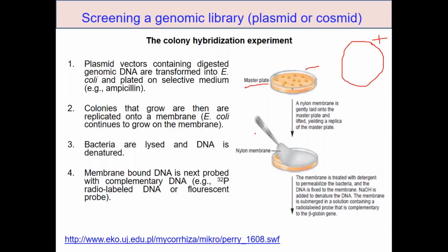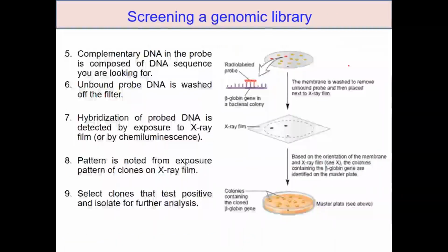One or two cells from each colony will be stuck. The position will be the same. Understood or not? You guys are following what I'm saying? Yes, exactly. Impression of colony.